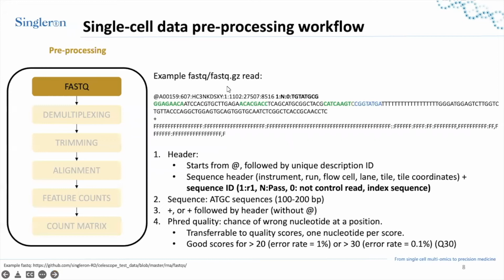So this sequence here is a typical sequence in the Fastq files. In the Fastq file, we will see many sequences, and this is one of them. Each one represents a read in the Fastq file. Each read always takes 4 lines.